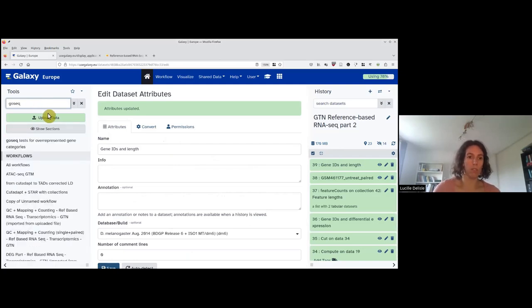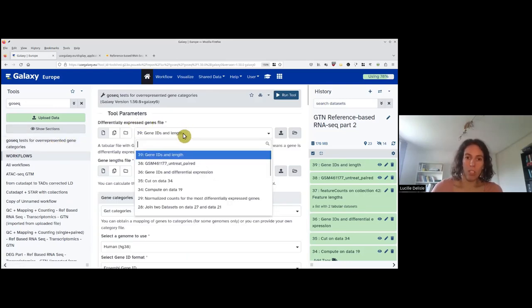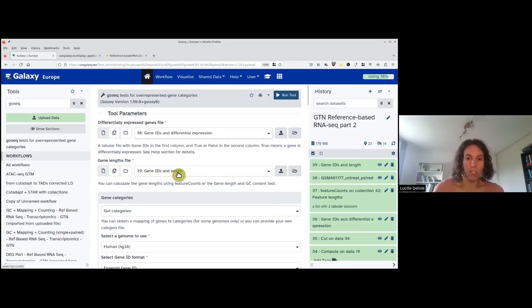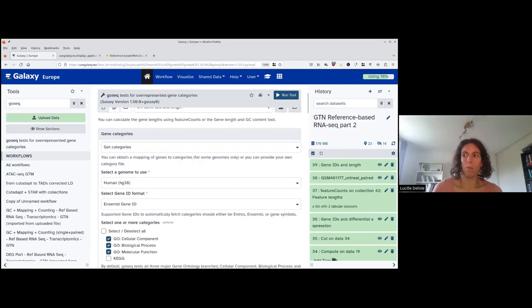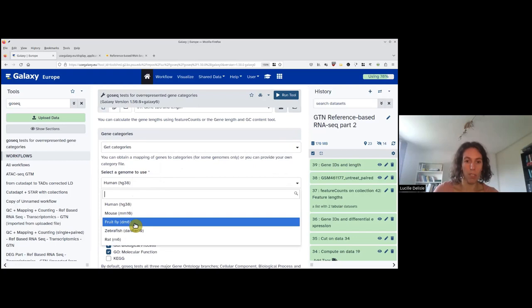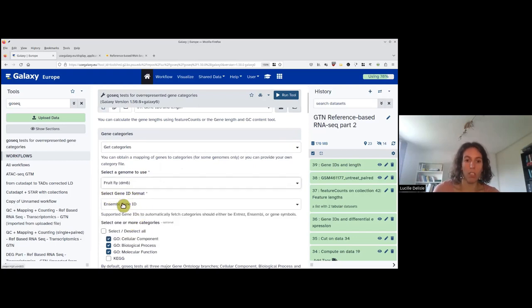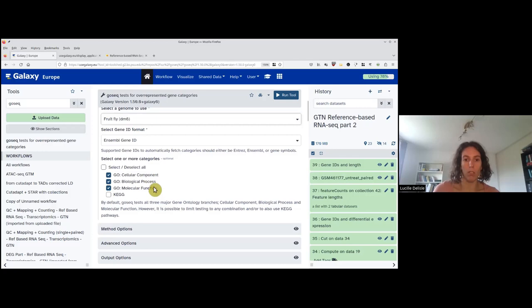We use the GOSeq tool. Input 1 is 'gene IDs and differential expression,' input 2 is 'gene IDs and length.' We can get the GO categories from the package because the genome we are using is available in the list. The gene ID type is Ensembl gene ID. We will use all three categories: cellular components, biological process, and molecular function. In output options: yes to a plot for the top GO terms, no to diagnostic plot, and yes to extract differentially expressed genes for the categories. We run the tool.